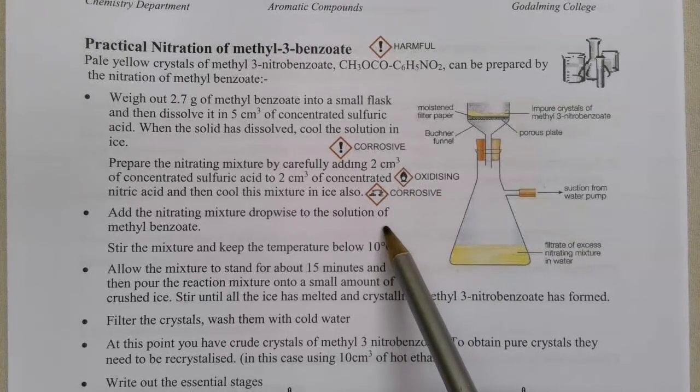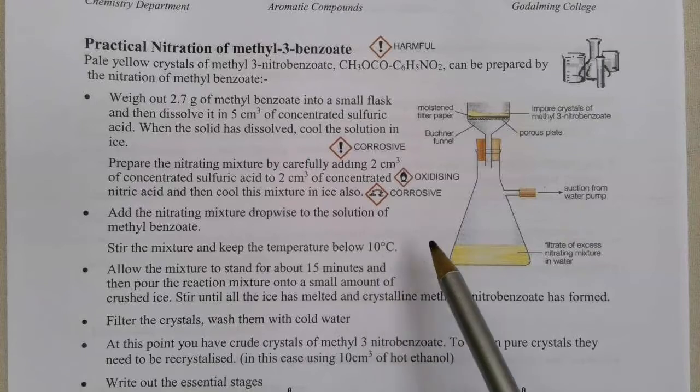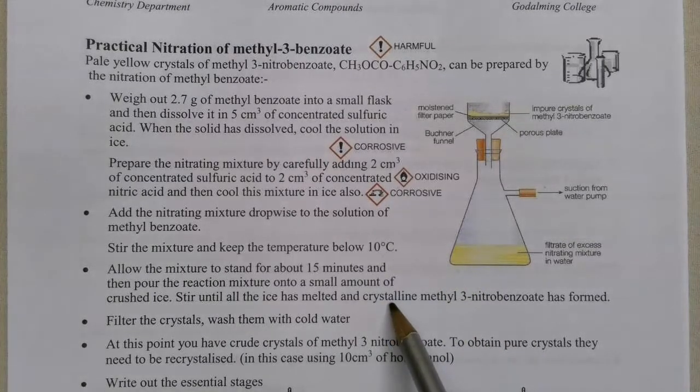You need to add the nitrating mixture dropwise, keeping the mixture in the ice bath. So we're trying to keep the temperature below 10 degrees Celsius. Going up to 15 is fine, but going over 20, we're likely to risk multiple nitrations. Once you've added all of your nitrating mixture, you let it stand for a small amount of time and then pour the reaction mixture onto the crushed ice.